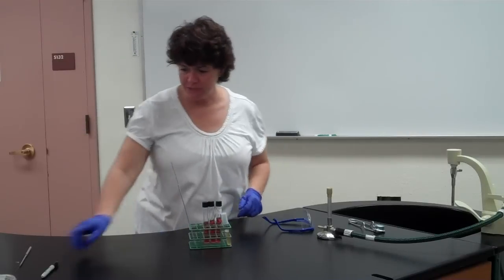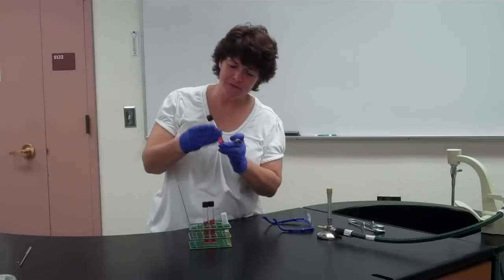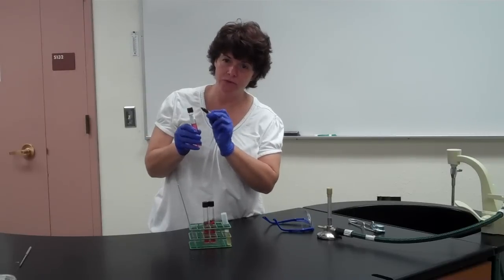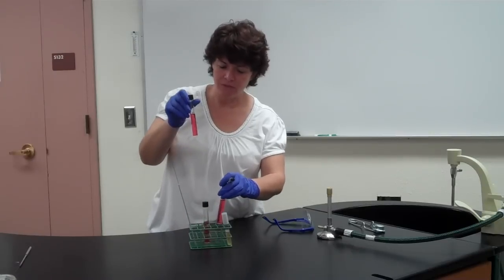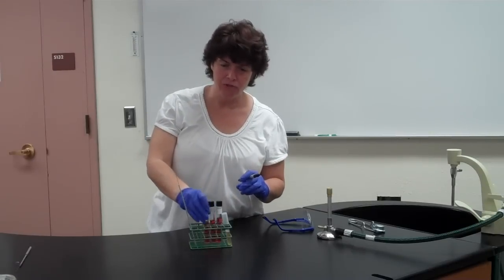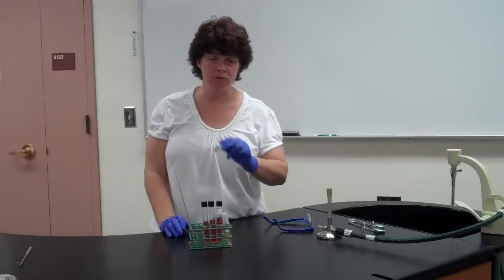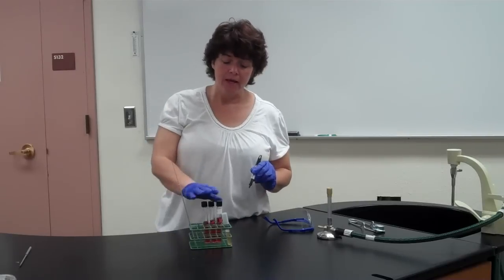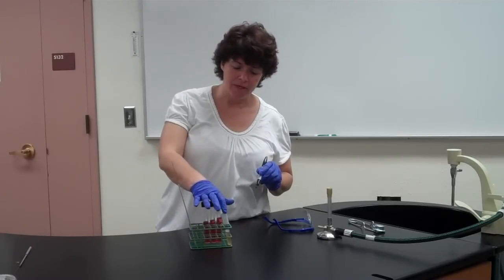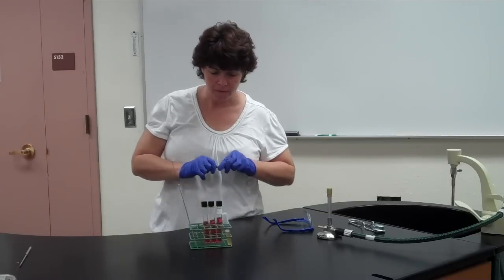So the same thing as we did last time, make sure you label the tubes. Now the tubes themselves have the name of the media, like this dextrose, which is glucose, says it on the label. This lactose will say LAC, and the sucrose will say SUC. So if you don't know what that means, write it out. So write sucrose and lactose so that you know for sure. We don't want to mix anything up. And then once again, you'll label with the name of the bacteria and your group name.